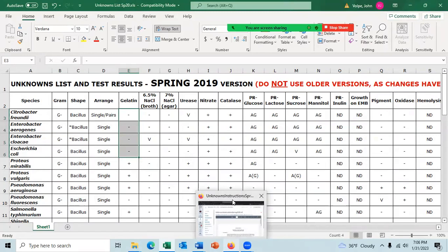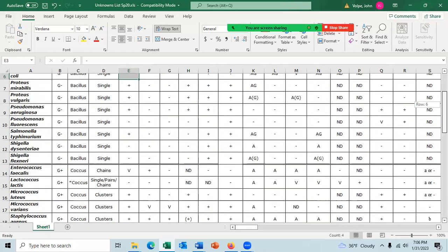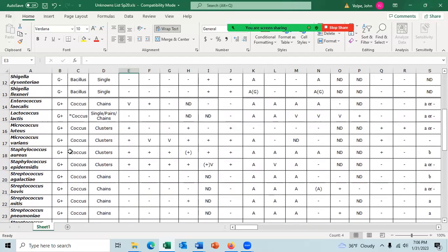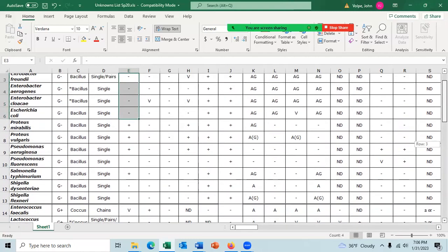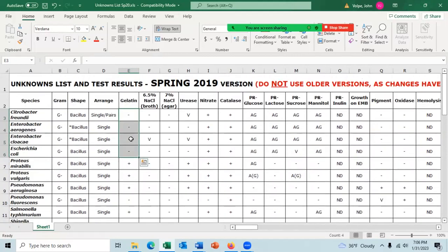Dichotomous logic means you'll be separating out your possibilities one test at a time. Like you do the gram test and it's gram negative. That means when you do the first test, you've now eliminated all of the gram positive species. And so all of the species under consideration are now only the gram negative. And I told you you're going to be doing the gelatin hydrolysis test.